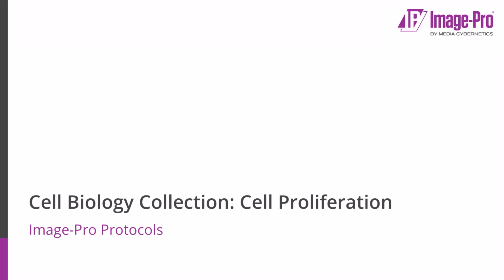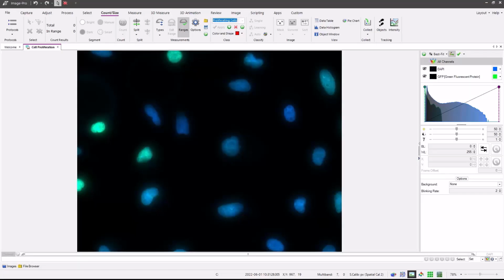In this short video, I am going to discuss the cell proliferation protocol, which is part of the cell biology protocol collection. The protocol is designed to measure the population of proliferating cells, which is based on a two-dye experiment.